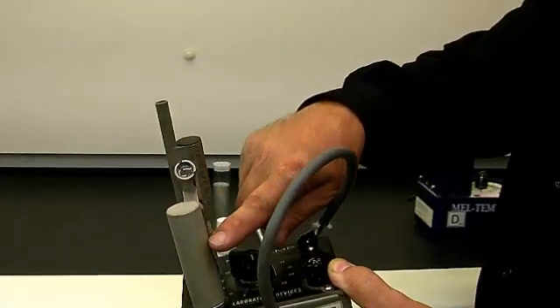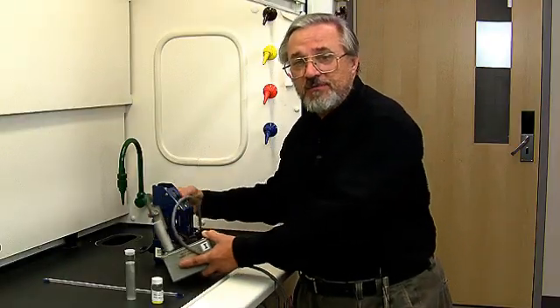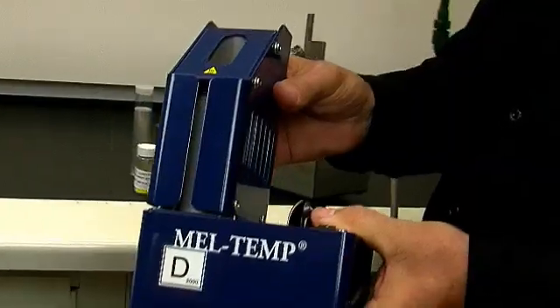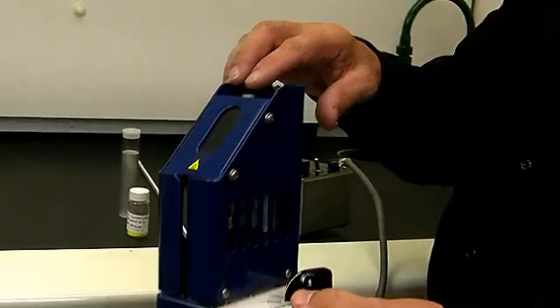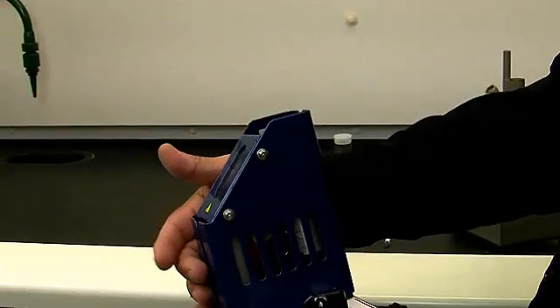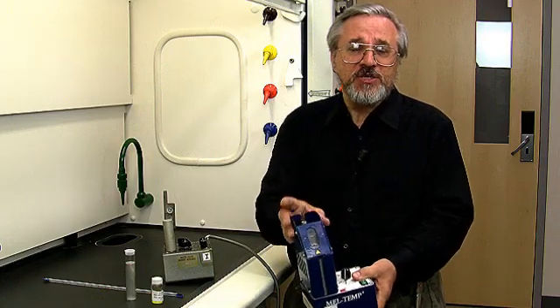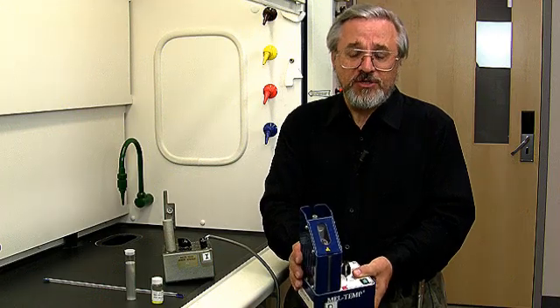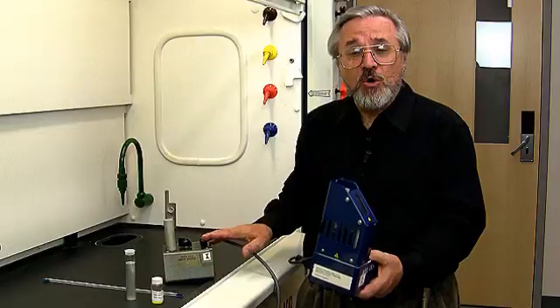There's also a lamp here which illuminates the sample. Now there's a newer version of the melt temp, and the only difference between it and the older version is a shield, because the aluminum block gets very, very hot, and so does the lamp. In order to avoid getting burned, the manufacturer has constructed this shield around the place where the melting point actually occurs. But we're not going to use this one, although we do have it in the laboratory — we're going to use the older version.